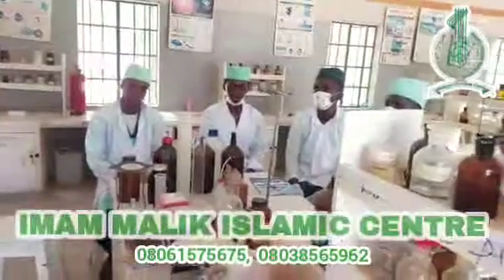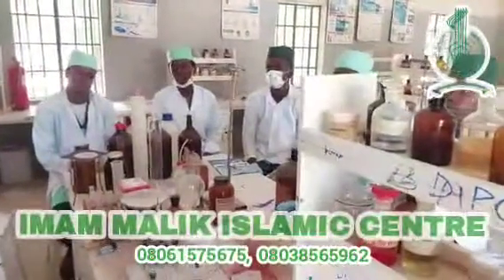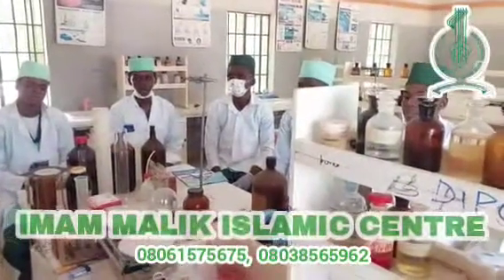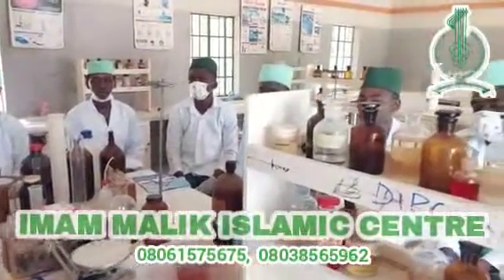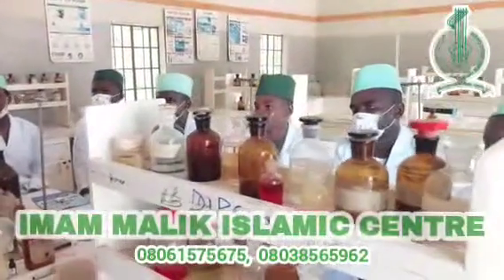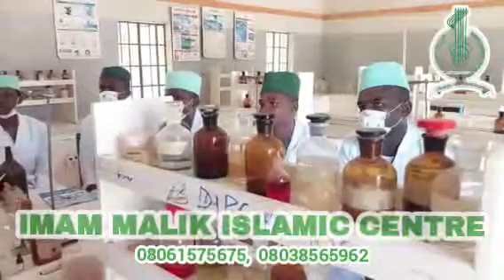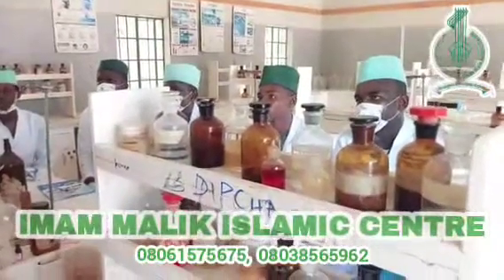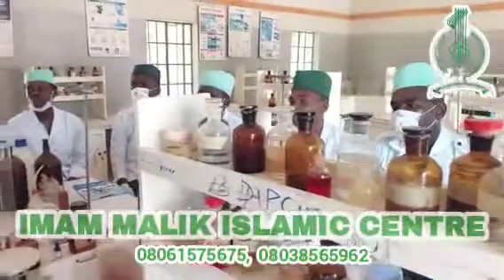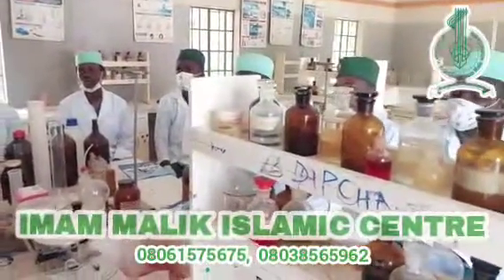So these are the common apparatus we have in the laboratory. So let's take some of the importance of this laboratory apparatus. What are their importance? Why are they here? Most times, these apparatus we are seeing, they are costly. So much money is used to purchase all this.